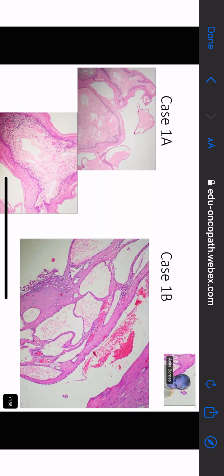Actually, it's a pale eosinophilic material that is being filled in the area. Dia, do you want to change that word secretion? Yes, ma'am. I was wrong. Now I am getting it, because secretions I would have used only if there was any lining to it. Means if there was any cuboidal or some columnar lining, then only some space would have secretions.